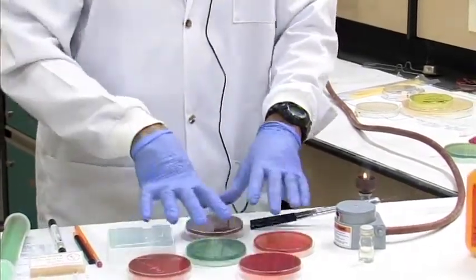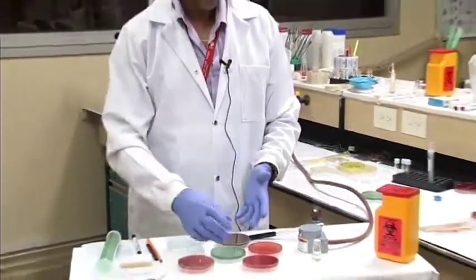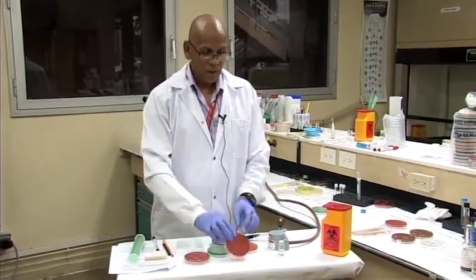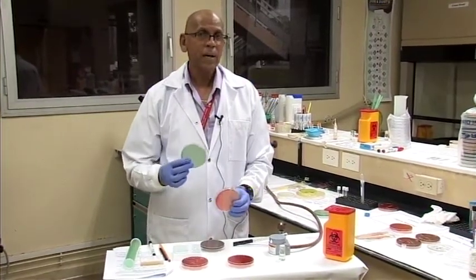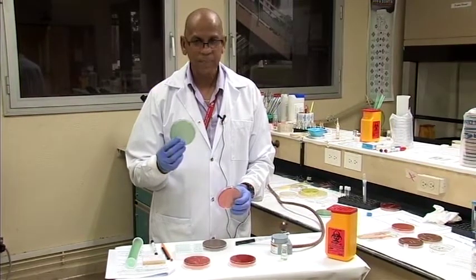The purpose of using different plates is because you have different pathogens needing different growth requirements. Your blood agar plate will grow generally all types of bacteria, whether it's gram-negative, gram-positive, and so on, whilst your MacConkey and CLED are mainly for the gram-negatives. CLED can grow both gram-positive and gram-negative, so it is a multi-purpose plate.